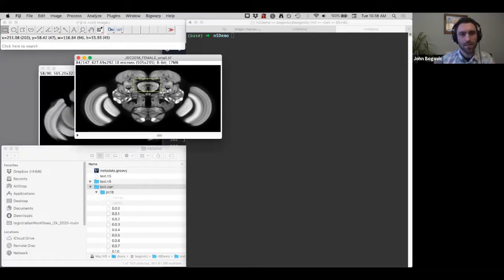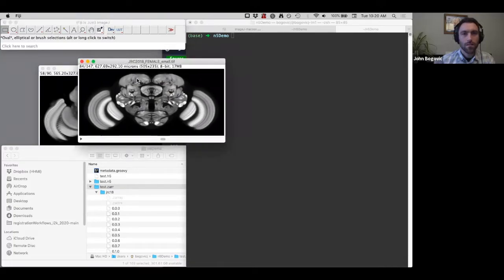For example, let's say I'm just interested in this area here. Okay, so this point is about at pixel location 192, so I'll round that up to 200. This one is something like 3, we're at 250, and we'll say 300, 100.